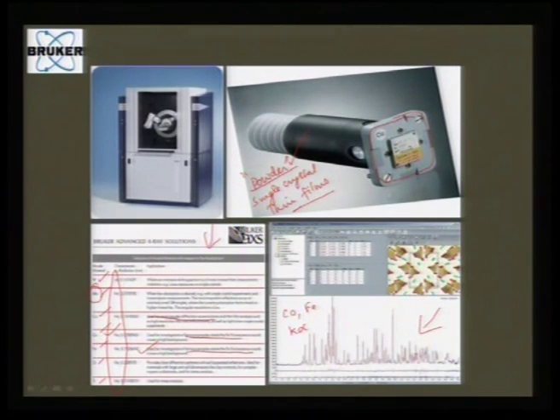As you can see here, this is the output that you would get for a typical powder XRD pattern for a complex material, and you can see so many peaks are there, and it could be as simple as 3 or 4 peaks in this whole spectra if it is a highly crystalline and cubic pattern.